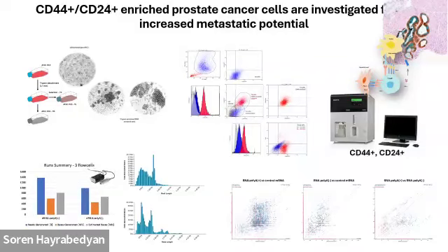So what I'm going to show you is a simplified approach, not to a whole tissue. We have one project for several years. We used the long-read direct RNA sequencing to look for long non-coding RNAs and other RNAs that we can analyze directly.